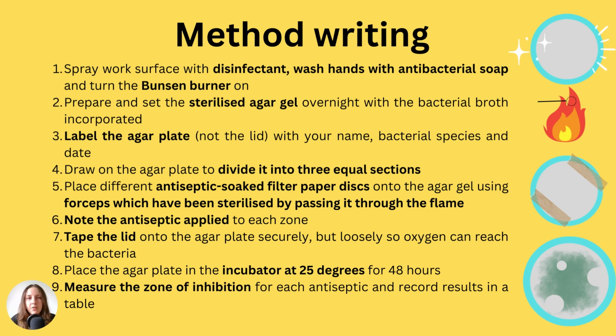Because what we're doing in this experiment, we're actually testing to see how well those, whether it's an antiseptic or an antibiotic, how well it actually works at destroying and killing and stopping the growth of that bacteria. And to do this, you want to open the lid carefully, open it only slightly so you can basically put the disc in, but you're not opening all the way, and that's just to prevent any bacteria or contaminants in the air getting into the gel.